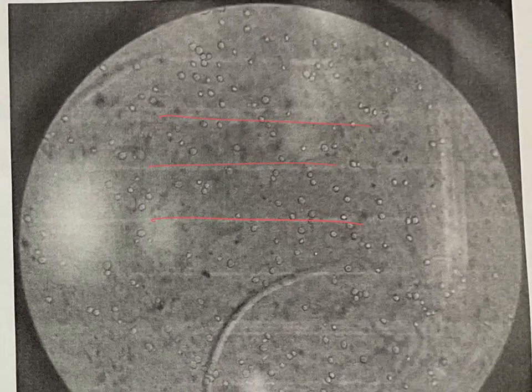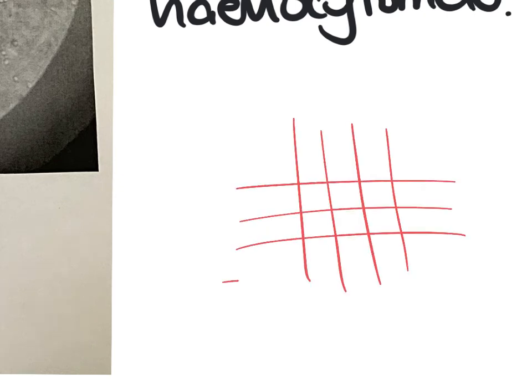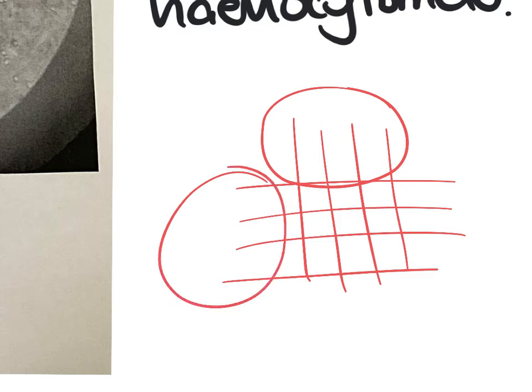Just be careful, because whenever you look at the grid, if you take your photograph there, you're only going to have vertical lines, or if you take it there, you're going to have horizontal lines. You need to make sure that you should have taken it there. Okay. If you don't think you've got a decent photograph, then get somebody else's. All right.